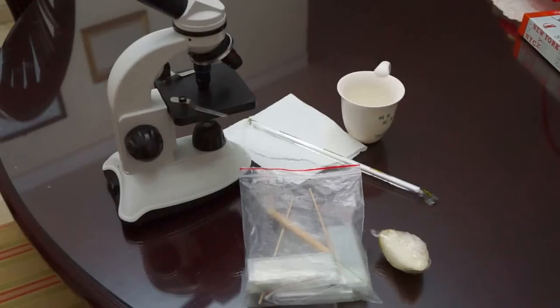Hello and welcome to another science experiment video. Today we are going to be seeing onion cells on the microscope.